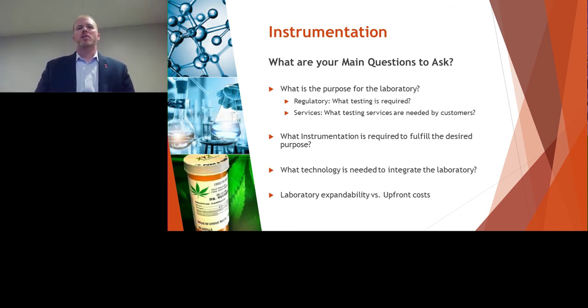So you have to weigh those different components. You spend a little bit more up front so that you have better capabilities, but you don't want to spend so much up front that you're buying something that you'll never actually get to use.